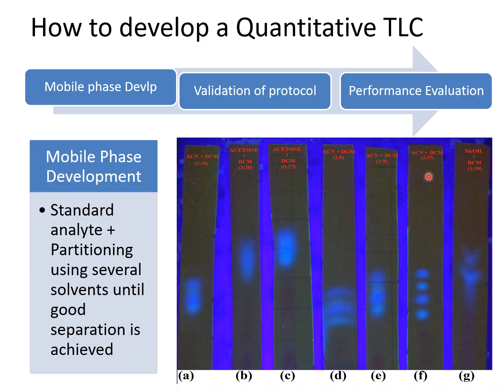However, this solvent system has to be validated. It has to be subjected to further validation before being adopted for analysis of unknown samples. In other words, the developed TLC must be validated to ensure it meets the scientific standard benchmark before it can be put to use.